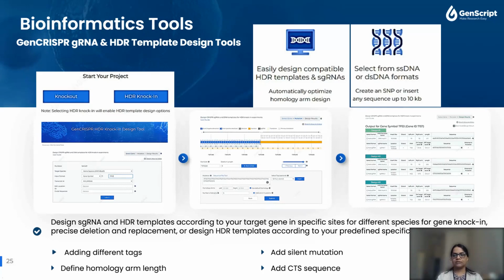They can optimize the sgRNA by adding a tag or purification option or localizing the target protein, etc. Additionally, users can specify the quantity, purification method, and delivery format. So this is a very basic tool which is always needed, and it's available free online.